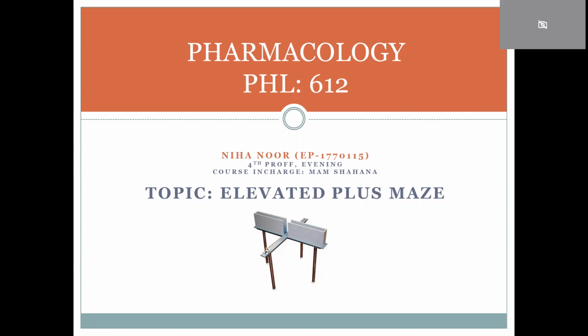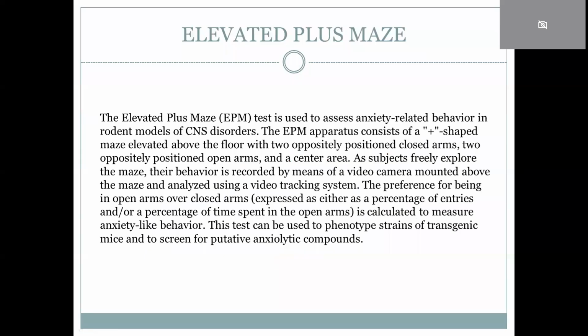And my topic for the assignment of Pharmacology Lab PHL 612 is Elevated Plus Maze, in which my subtopic is limitations. But first, we'll discuss what is Elevated Plus Maze.